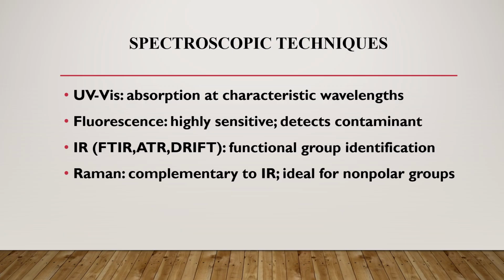IR, or infrared spectroscopy, especially FTIR, is used on production lines to measure fat, protein, and moisture without sample prep. Techniques like ATR and DRIFT enhance IR versatility. Raman spectroscopy complements IR by detecting changes in polarizability. It's particularly effective for proteins and nonpolar molecules.